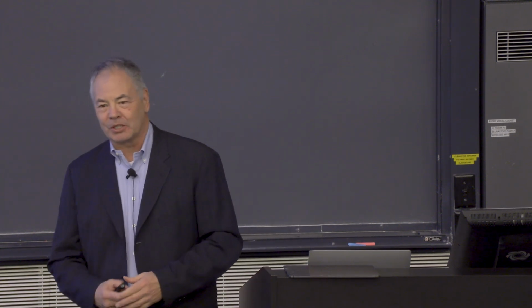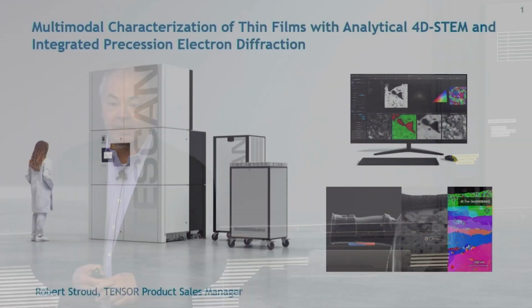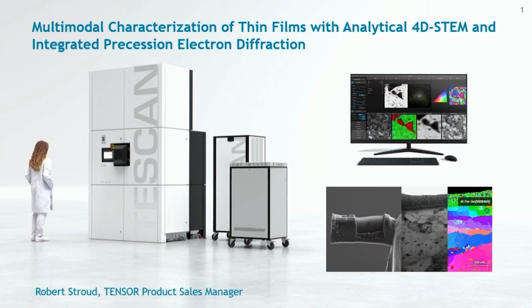I'd like to thank everyone for the opportunity to come and participate in your seminar today. I wanted to tell you a little bit about this tool that we've come up with at Tescan, and particularly aspects of it related to multimodal characterization and focus on diffraction techniques.